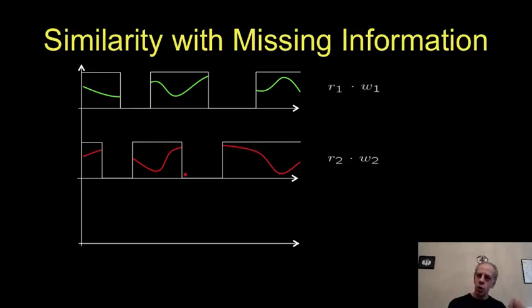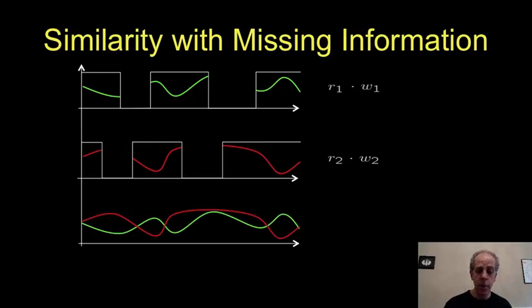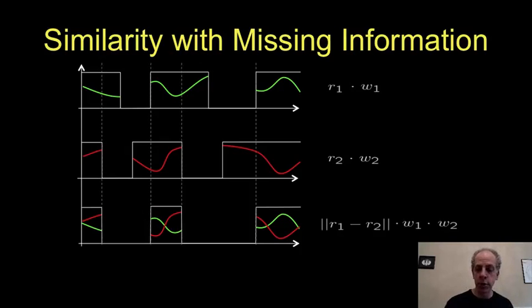Now you actually know where the missing wedge is, or you can guess it. Either you know from the instrument, or you guess it because there is a lack of signal to noise there. And these are basically the two images that we need to decide a distance between. We wish to have them complete, but we only have portions of them.